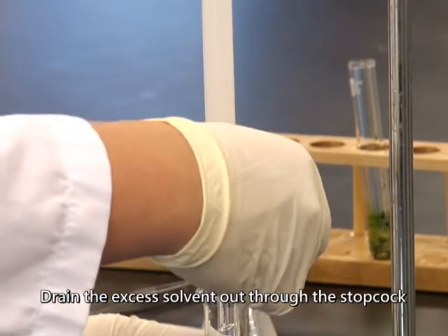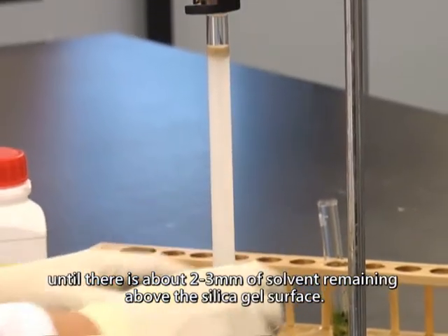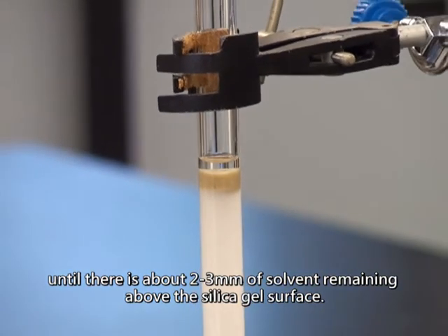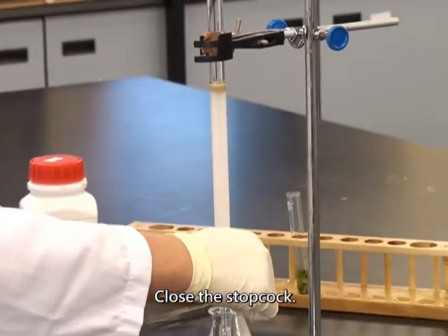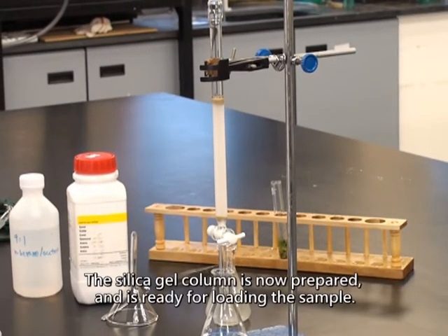Rinse the inner surface of the column with a small amount of solvent. Drain the excess solvent out through the stopcock until there is about 2–3 mm of solvent remaining above the silica gel surface. Close the stopcock. The silica gel column is now prepared and ready for loading the sample.